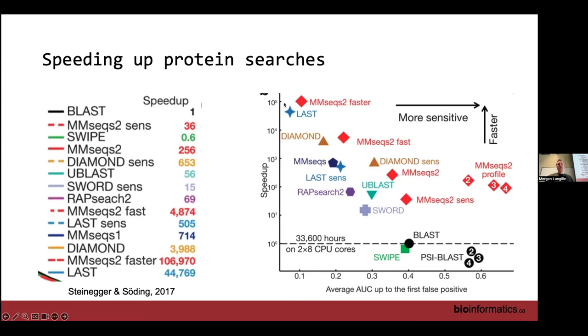Sometimes they're a bit focused on environment. Sometimes they're human focused, like where they've said, we've made a new human gene catalog, right? That you can search your reads against. And sure enough, it's very good. This one's a global microbial gene catalog. And so the idea here is instead of sort of searching against UniRef, you would search against this. And, you know, at this version one, they had 300 million unigenes.